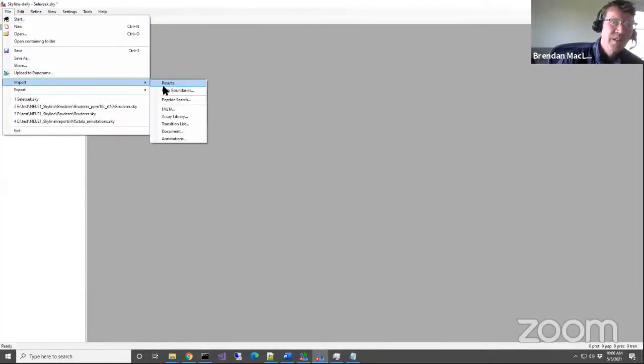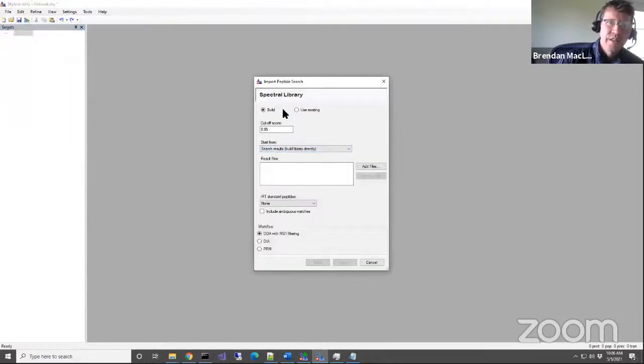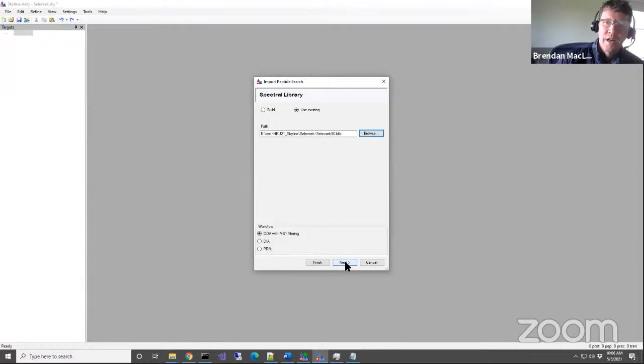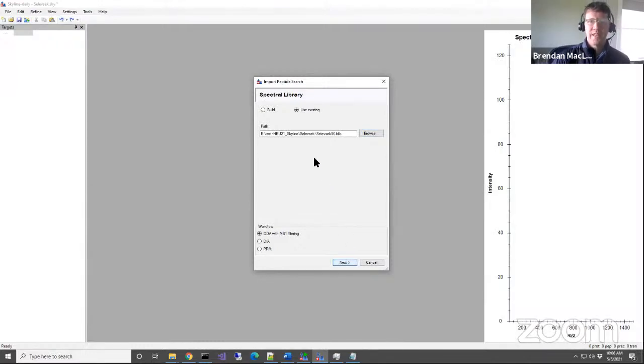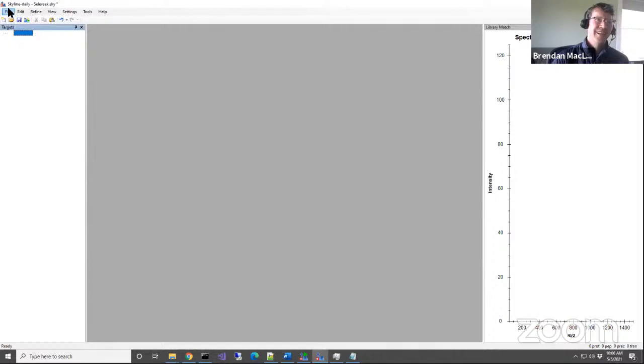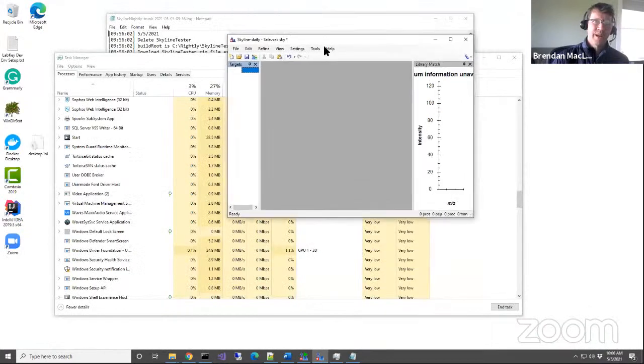File, import, peptide search, use existing. All right, so now I think I should be back to where... Sorry.